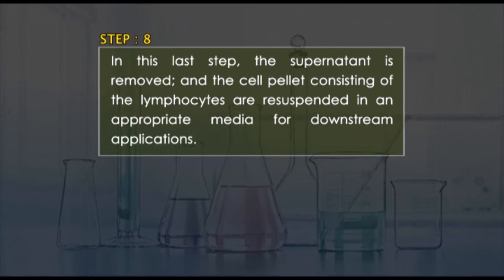Step 8. In this last step, the supernatant is removed and the cell pellet consisting of the lymphocytes is resuspended in an appropriate media for downstream applications.